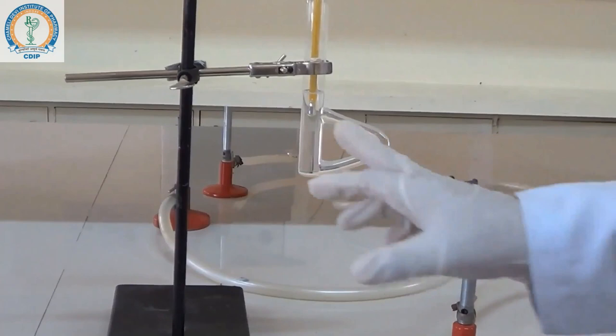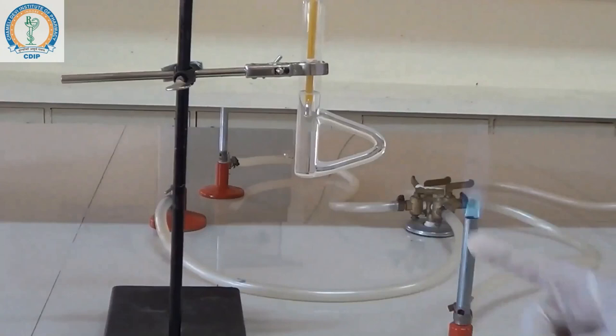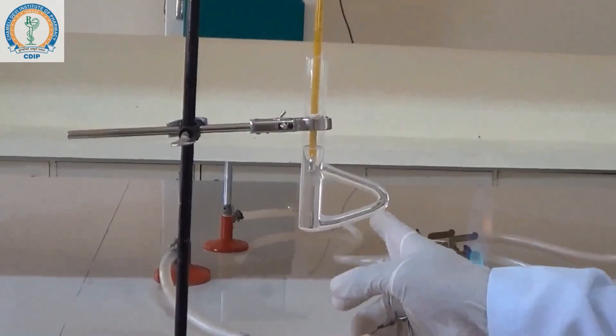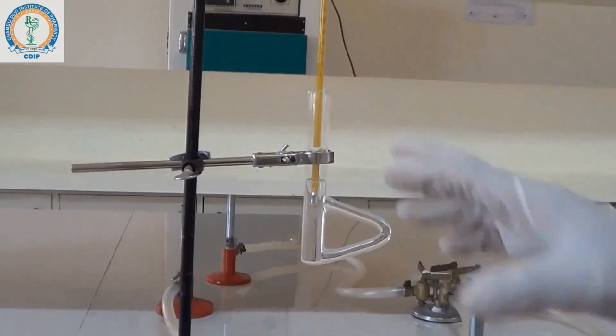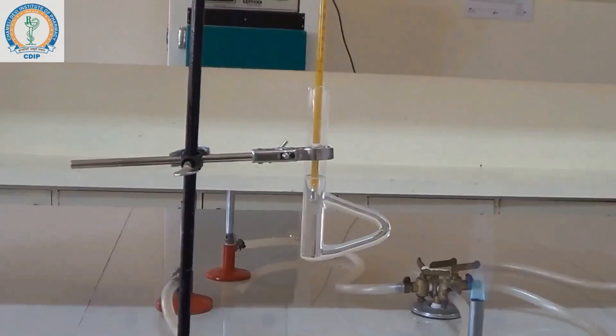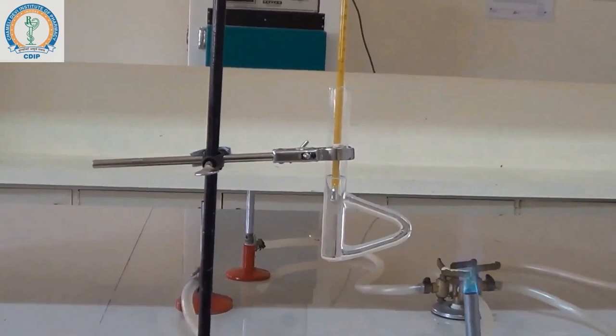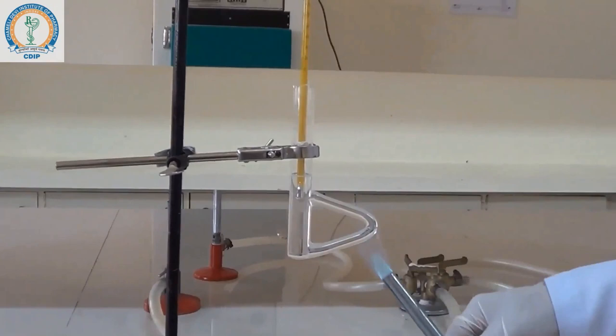This is the complete setup for the determination of melting point. In this tube, we have filled liquid paraffin up to just above the triangular arm. We have inserted the thermometer, which is tied along with the capillary tube filled with the substance to be examined. We need to put the flame over this triangular portion like this.